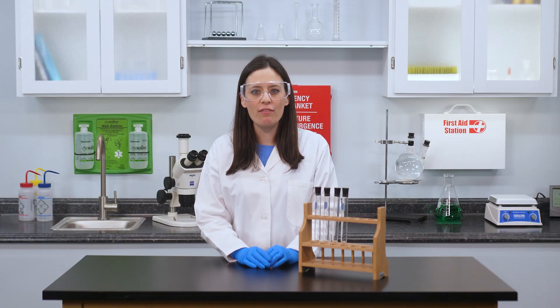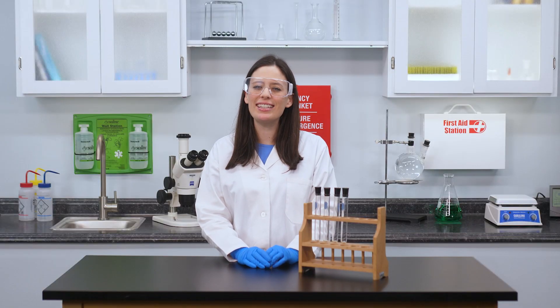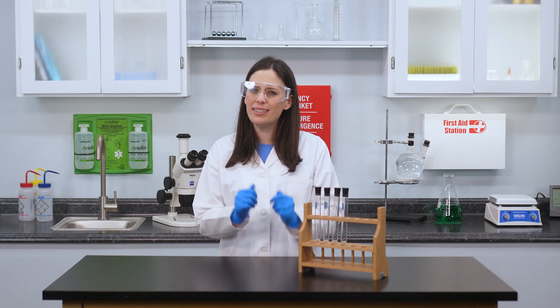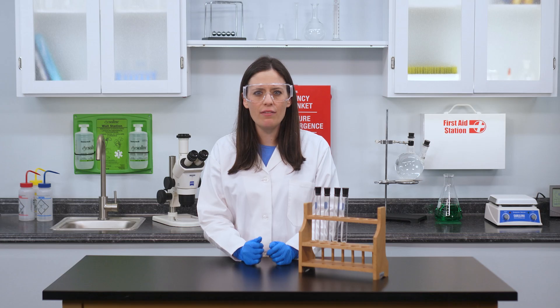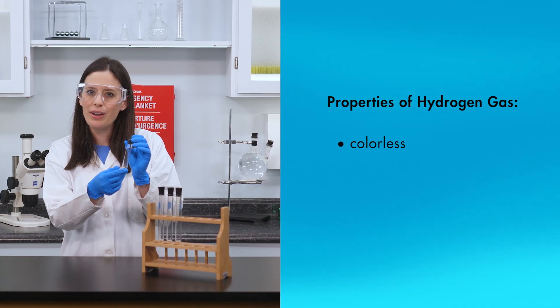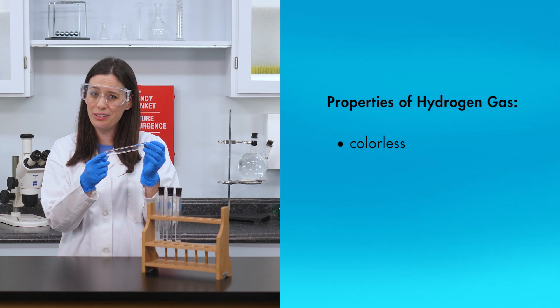Now that we have four samples of the gas, let's examine some of hydrogen's physical and chemical properties. What can we say about the color of hydrogen gas? Notice that the gas is colorless.